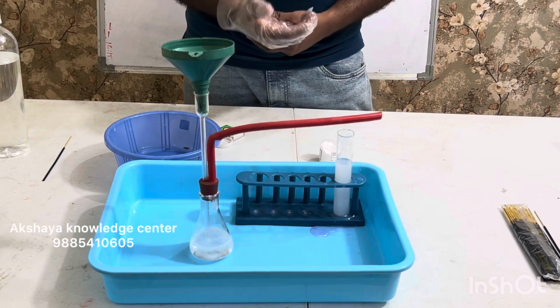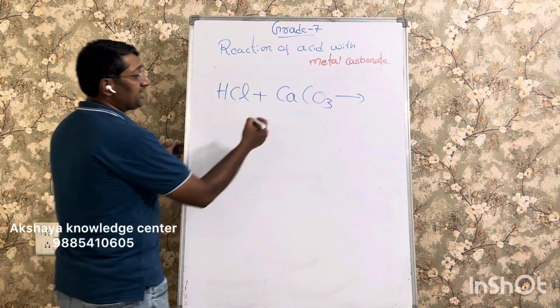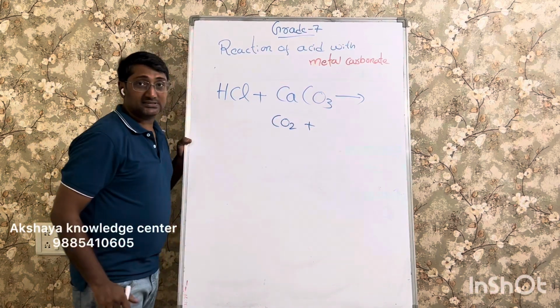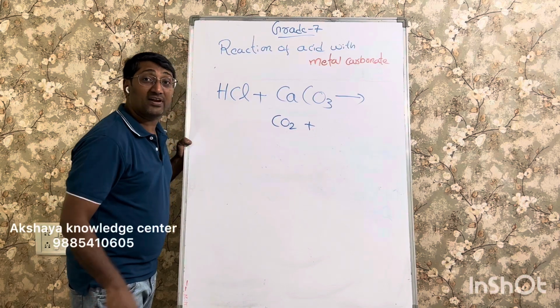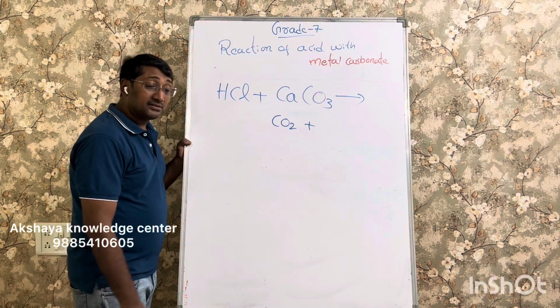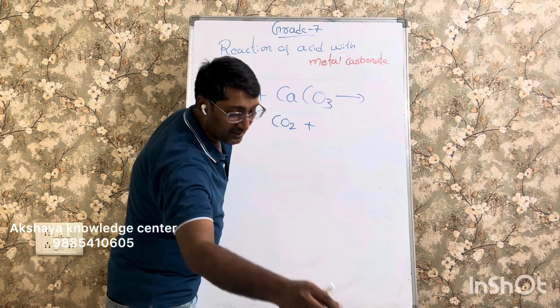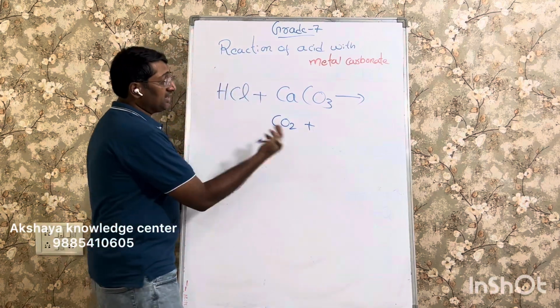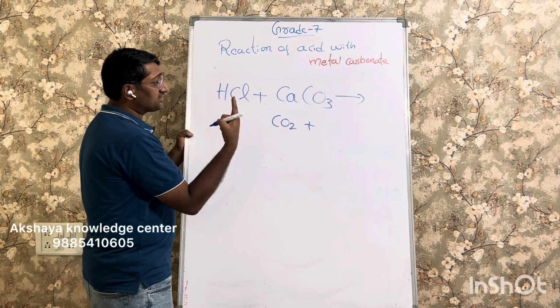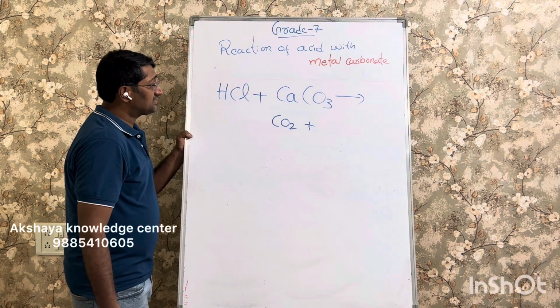Now let's discuss everything on the board. Now let's look at the reaction. We have definitely seen carbon dioxide gas. We tried two proofs. One is a basic proof of flame retardation, or putting off the flame. We already proved it. Then a more scientific proof is lime water turning to milk white color. So that is the main proof. Anyway, calcium carbonate with HCl gives carbon dioxide gas, and also please think about the remaining products of this reaction.